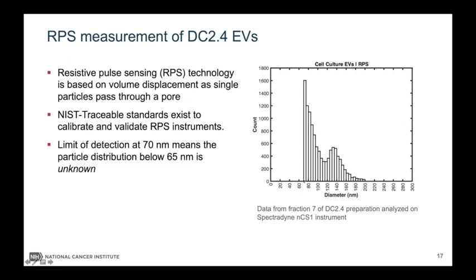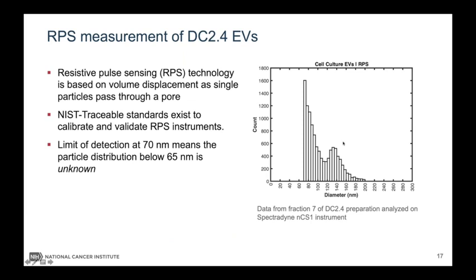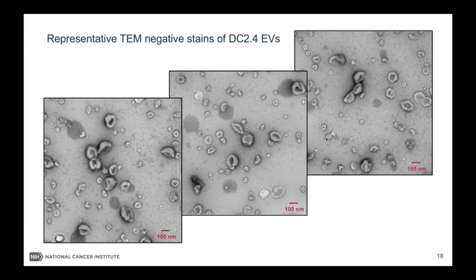The nice thing with flow cytometry and resistive pulse sensing technology is we can draw a very clearly defined limit of detection. And you'll see why this is useful later. After we'd performed both of these techniques, with an optical technique, flow cytometry, producing this diameter distribution, we have a non-optical technique that's validated this distribution. So regardless of assumptions, we're still getting the same distribution. And then we performed EM. You can see that there are lots of these very small particles in here, and then there's a second population of these larger particles.